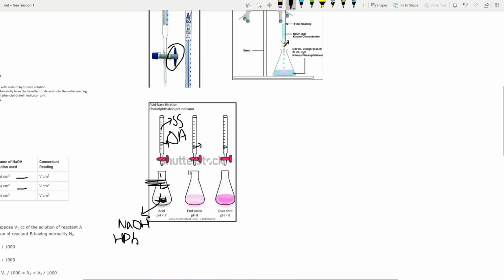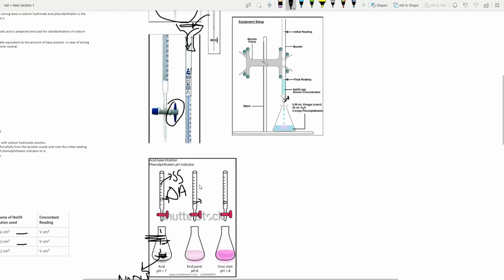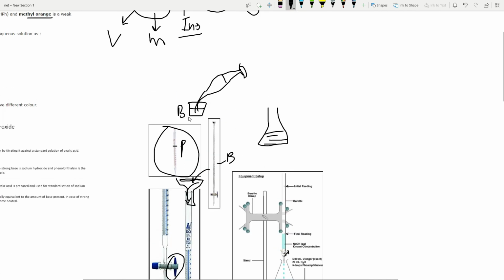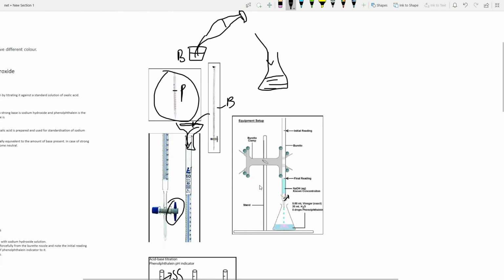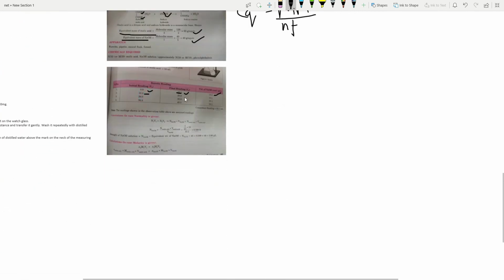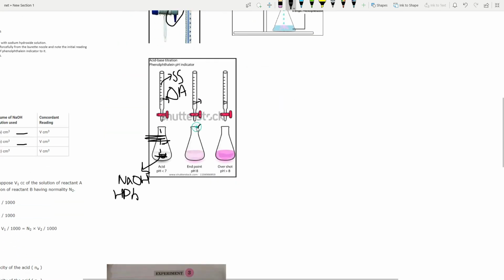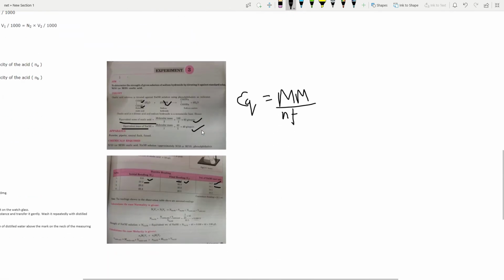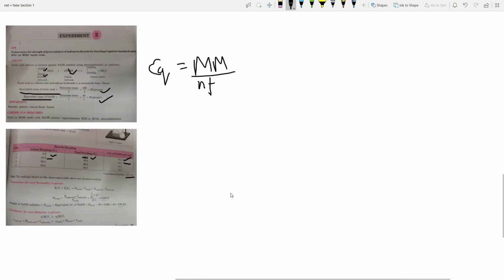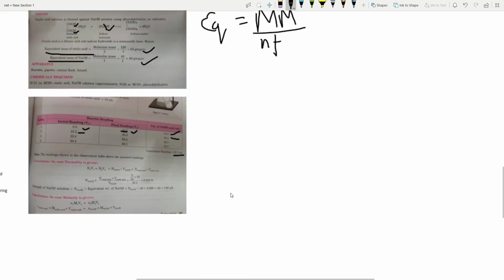Take this beaker, rinse it in the sink, and prepare another NaOH and phenolphthalein by taking NaOH from the pipette and pouring it into the beaker. Perform this 3 times, then throw the solution, make fresh, and perform it 2 or 3 times to get the average value. Here we have 10.1 as the volume of NaOH.